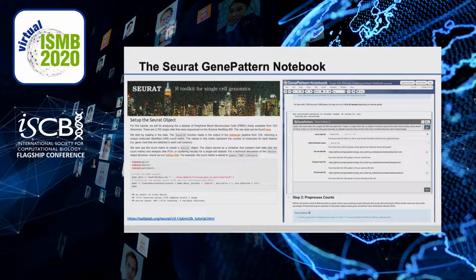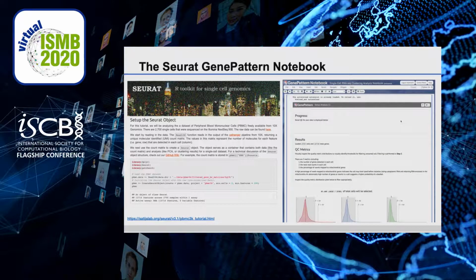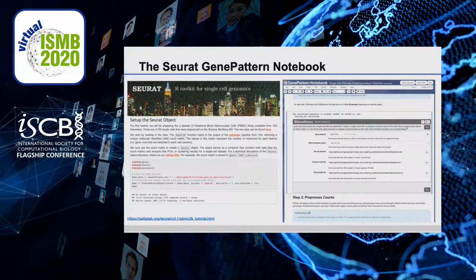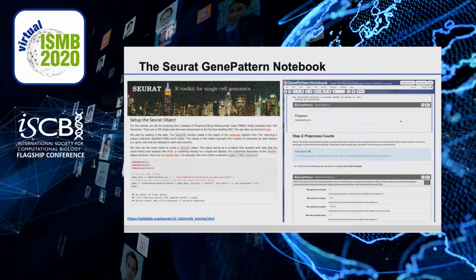Here you can see an example of a module that can load many of the single-cell file types, removing the need for users to configure their analyses for different formats. The cell loads the single-cell data in any of these formats and displays a visual representation of various common quality control metrics used for filtering single-cell data.